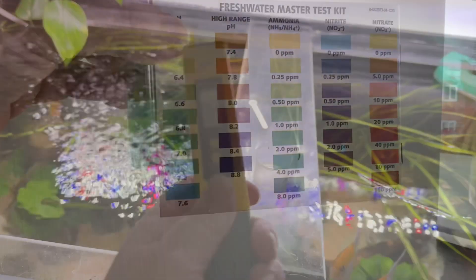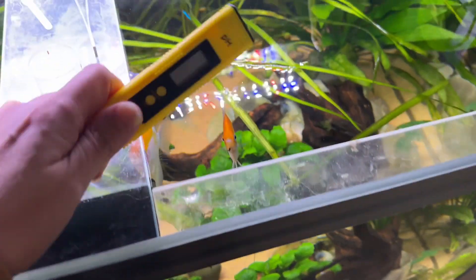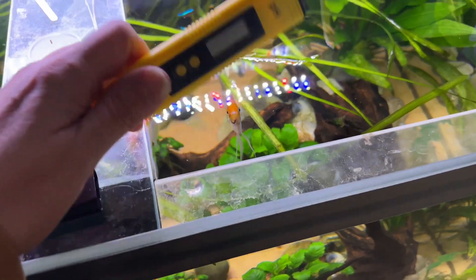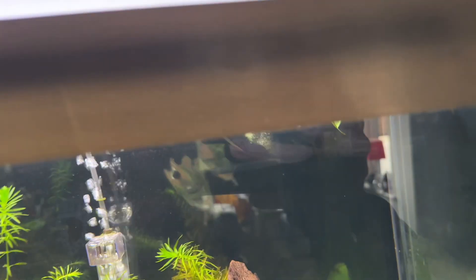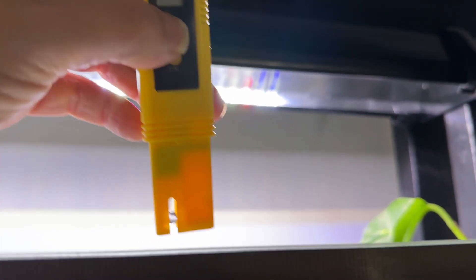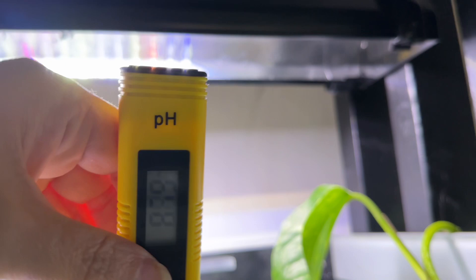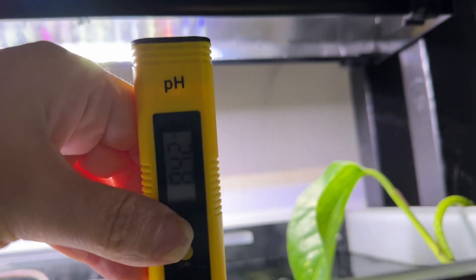Now I want to quickly show you the cheap pH tester — calibrated fresh off Amazon, calibrated with the solution, and we'll just see what this picks up. It always starts off high, but we'll give it a bit of a shake.